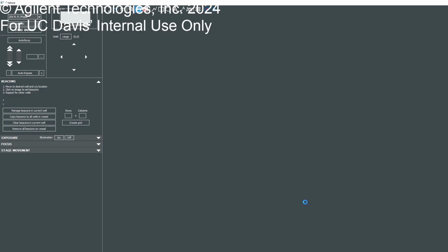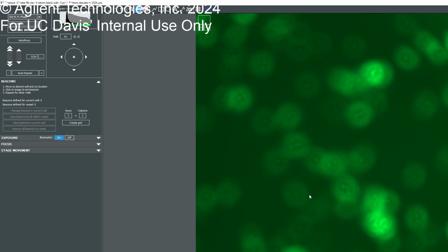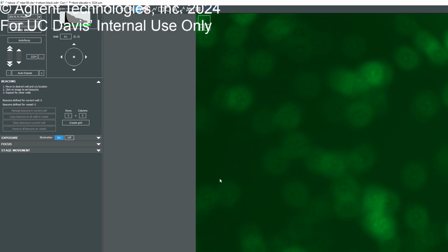So imagine your picture is made of 100 pixels. Instead of taking 100 pixels, it's going to combine those 2x2 pixels, and now it's only going to collect 25 big pixels. So the resolution is going to go down because it's compiling all the information that existed in 4 pixels into 1 pixel.